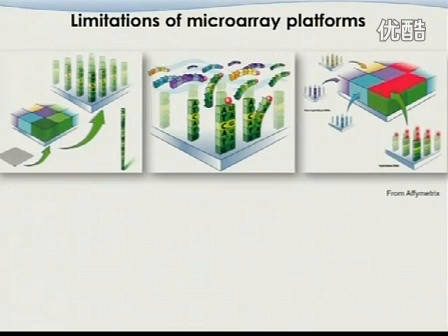The next step is we put in those RNA molecules, which can be changed to cDNA or another form of molecule. Each individual molecule here has a small red hat, which is a fluorescent or other type of label. If a molecule hybridizes to this region perfectly, it will stick there. But this one will not come here; it goes somewhere else.